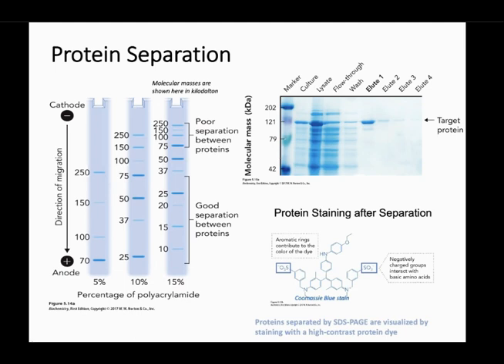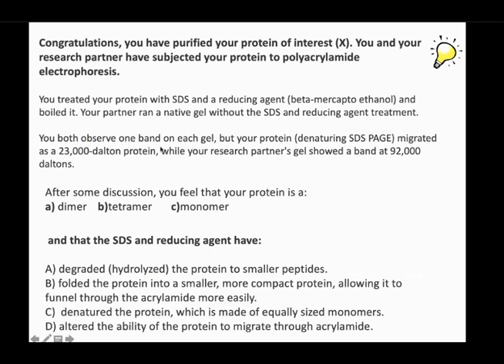As it was mentioned, we need something to stain the proteins, because when you run it, you need a color to look at the proteins. In this case, we use Coomassie Blue, and it's blue, literally. You can see all the bands that are the protein, they are blue, okay? So that's SDS-PAGE, and how to visualize, and we use molecular mass, okay? Any questions? All right.